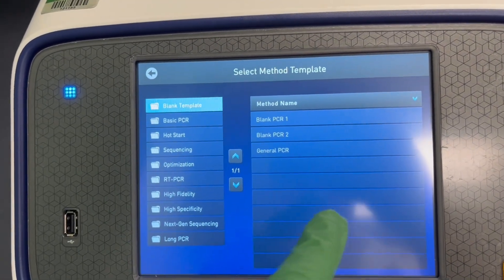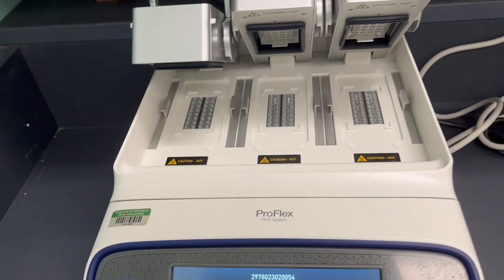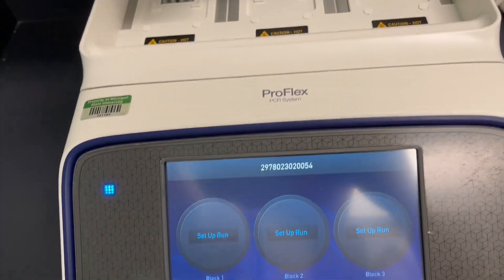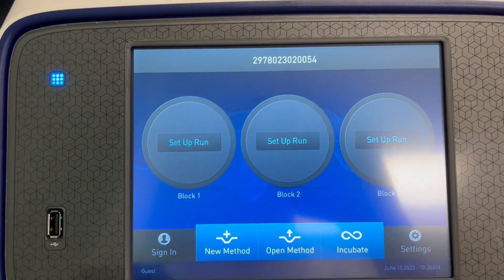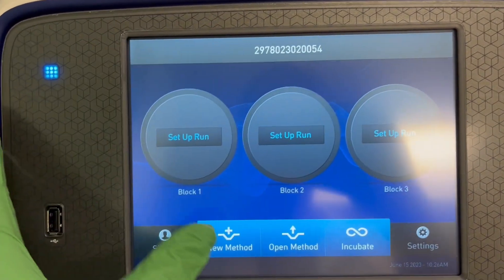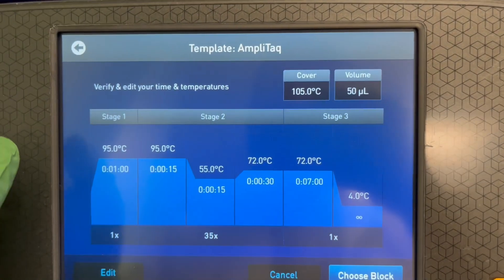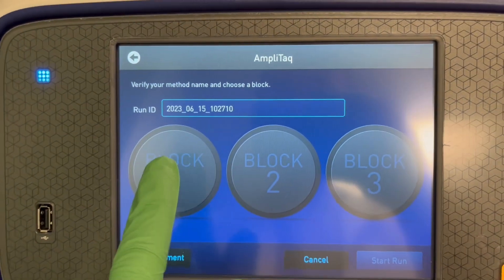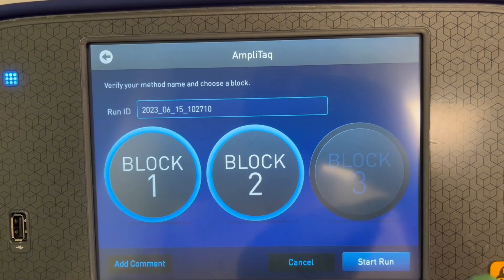We can go through the same tools we showed on the MiniAmp. If you had a bigger experiment and needed all the blocks, you could load your samples into two or three sections. Then if you hit New or Open Method from this screen and select a template — say AmpliTaq again — when you go to Choose, you'll have an option after editing the protocol to select either all three or just two of these blocks to run the protocol on, and then start your run.